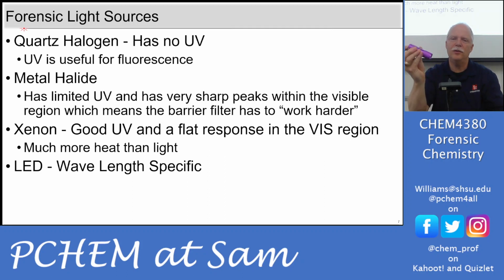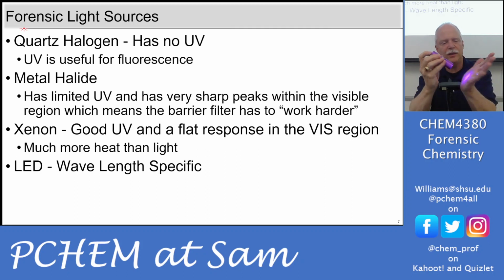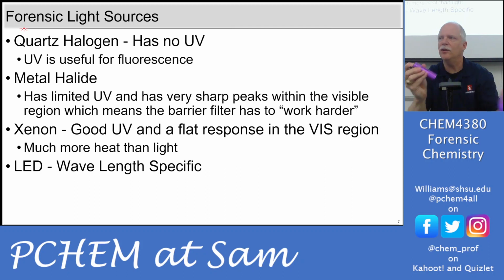And these are supposedly UV lights. They're not really strongly UV. You can kind of see purple light, so there's a lot of visible light coming in. It's not great. Did it die on me? Yeah, there it is. It's not a very bright light, and so it's not damaging my skin. You wouldn't want to do this with a strong UV light. But what this is sold for is an alternate light source for detecting things around your house.